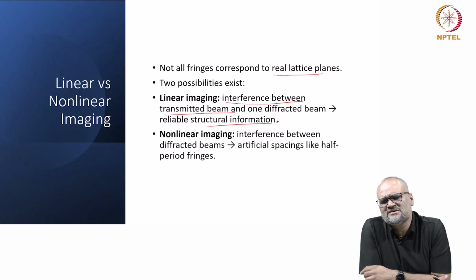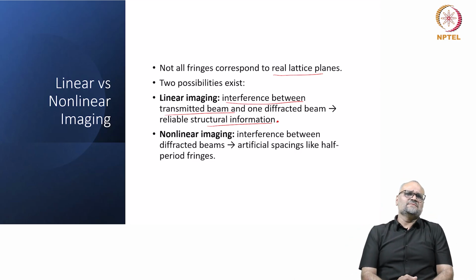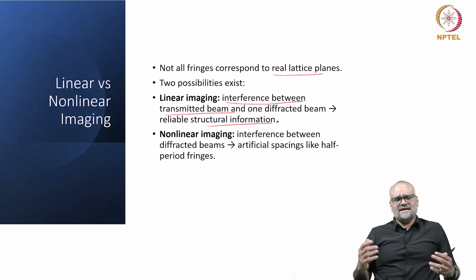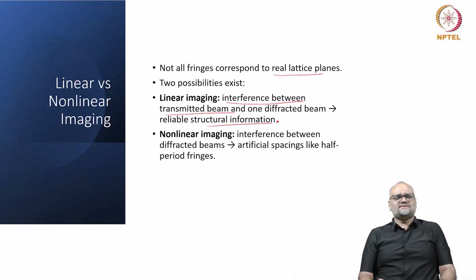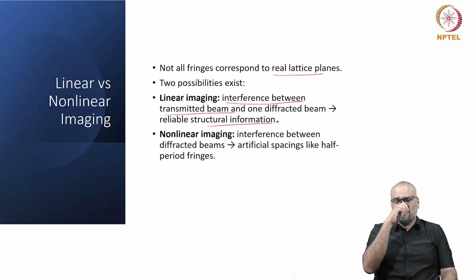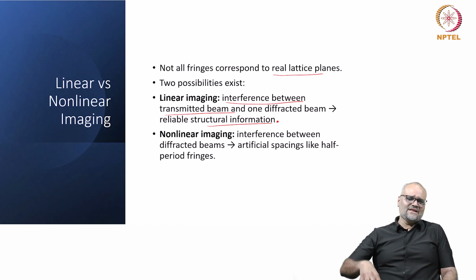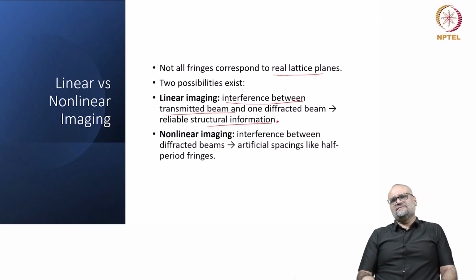Now, this gives you an opportunity: if I assume a specific model for the specimen and orient it in a zone axis, and from other X-ray diffraction or neutron diffraction techniques, and also from electron diffraction, I vaguely know which crystal system this specimen might belong to, I can come up with a model, simulate an example HREM micrograph, and check how it matches with the really recorded image.